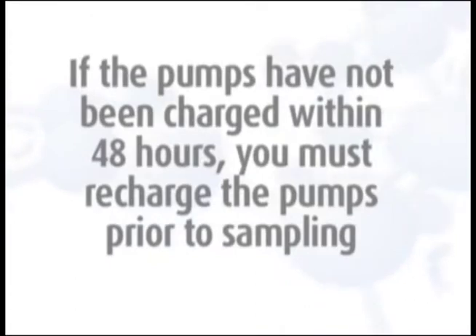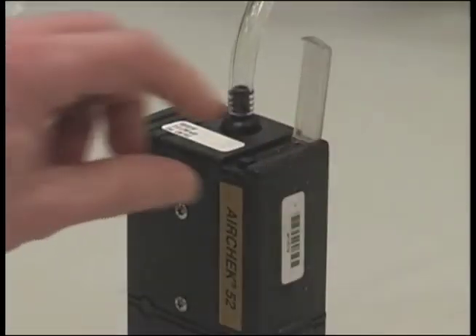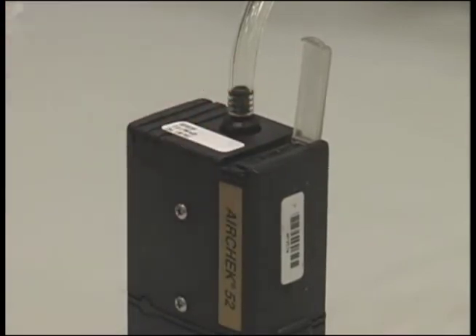To calibrate the pumps, they must be charged. If the pumps have not been charged within the past 48 hours, you must recharge the pumps prior to sampling. Start the pumps so they can be warming up. They need to run at least three minutes before you begin the calibration.